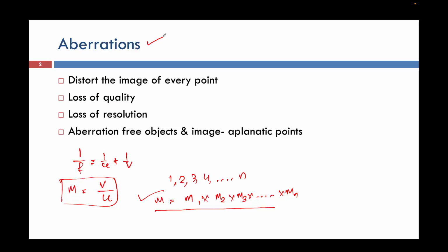Though we can get a higher magnification image, for a microscopist to see critical structural features of an object, we need high resolution also. Not only should magnification be high, but the resolution should be good enough so that we can distinguish between 2 points in an image. These aberrations are effectively defects of lenses.